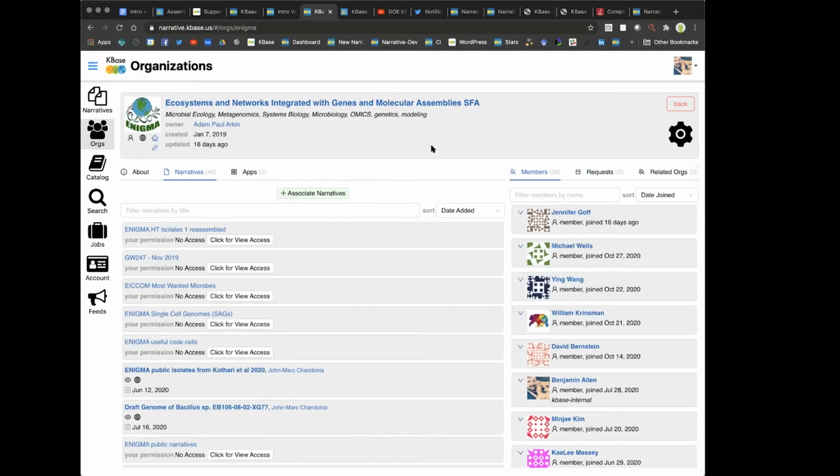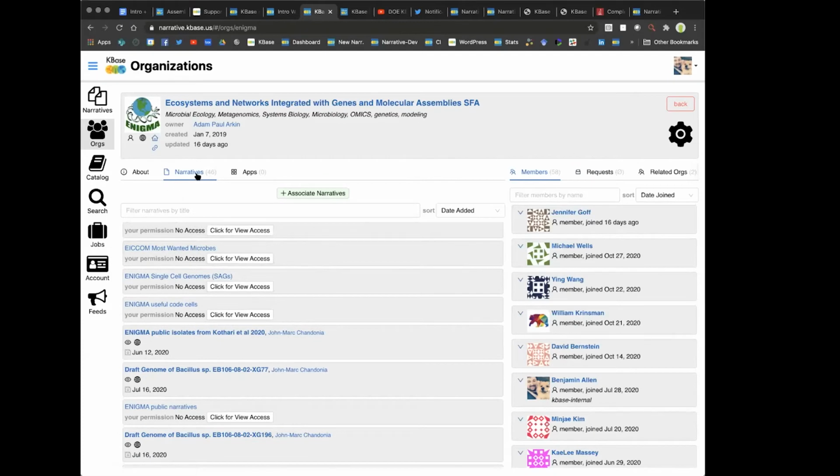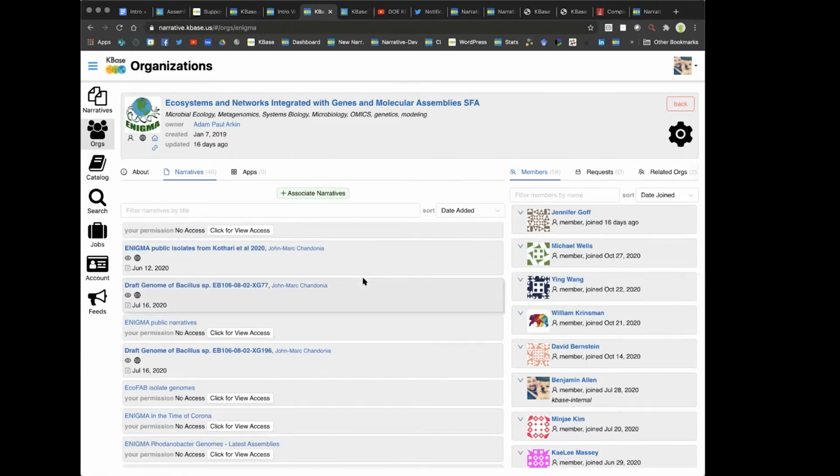But it allows you to sort all of your organization's narratives and data and give access to the various parties they're in. So here I have a list of narratives that are associated with this organization. You can see they're working on various genome drafts and stuff like that.